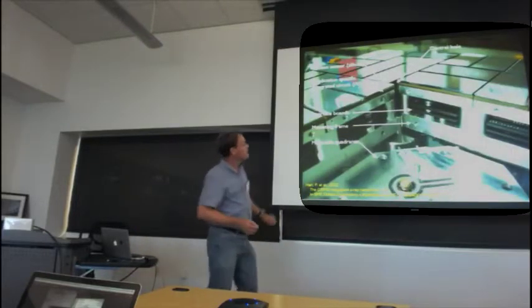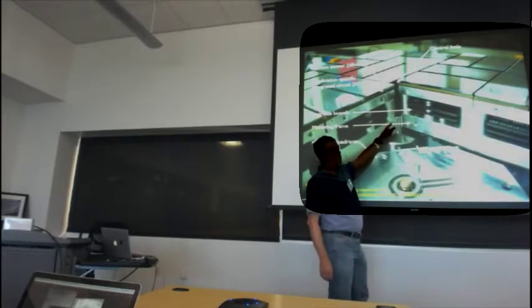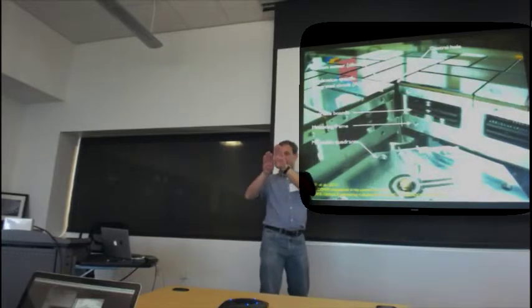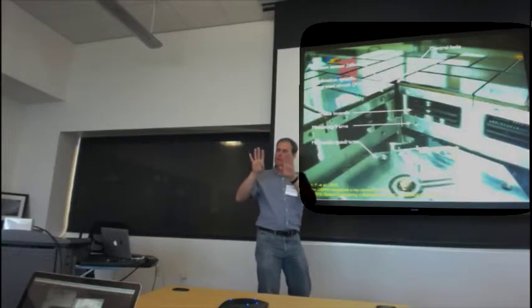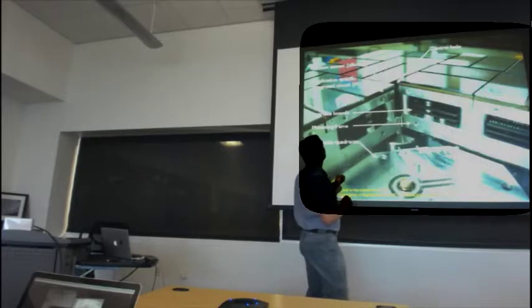Here's this plot again. We've got a central hole down the middle where the direct beam goes through, and that gap can be changed. These quadrants can shift relative to each other, and that means these four leaves can change position with respect to each other. Every time they change position with respect to each other, you've got to figure out the geometry again, or your auto-indexing isn't going to work.